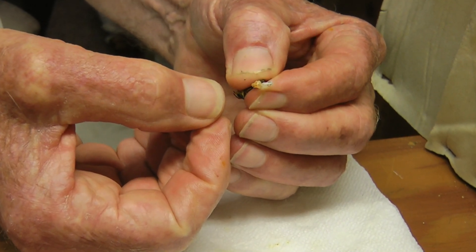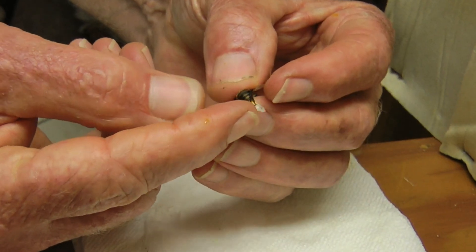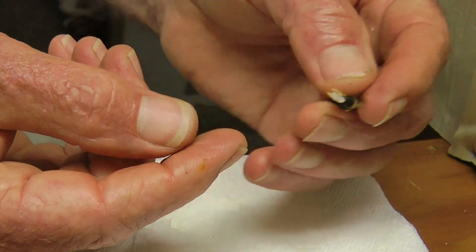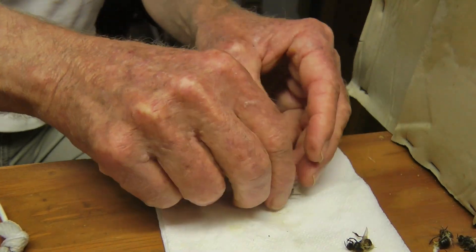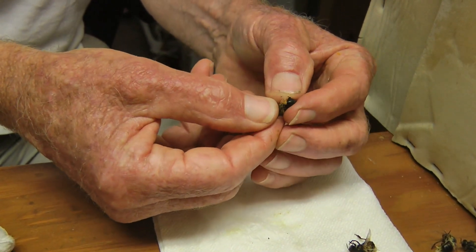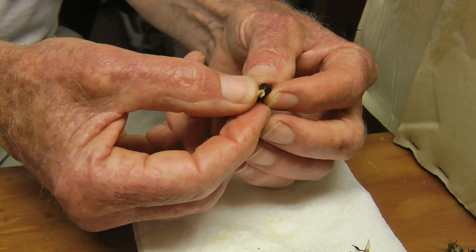And then I'm gonna squeeze it — and there is the endophallus right there. I'll get another one. There's another drone, and oh, that one just popped. That was very good.